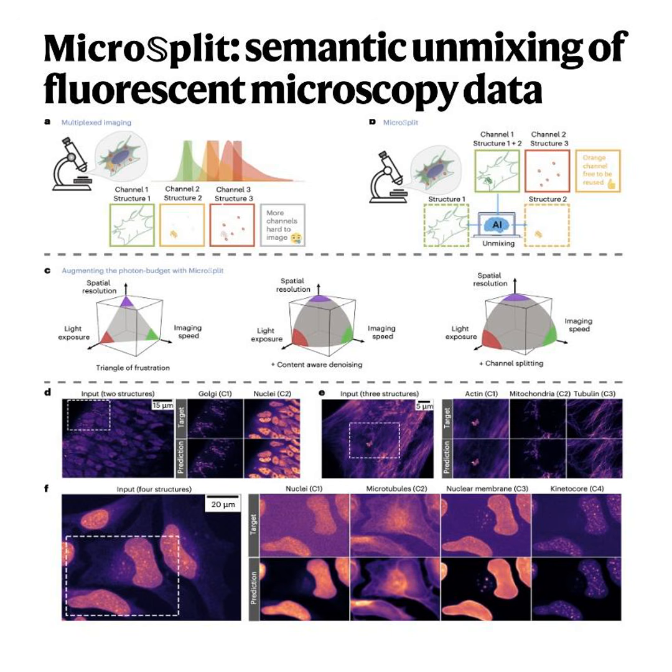Right, the network operates within a specific receptive field size. If the biological structures you're trying to unmix are massively mismatched with the input patch size, either way too huge for the AI to see the whole shape, or far too microscopic to register, performance drops significantly.